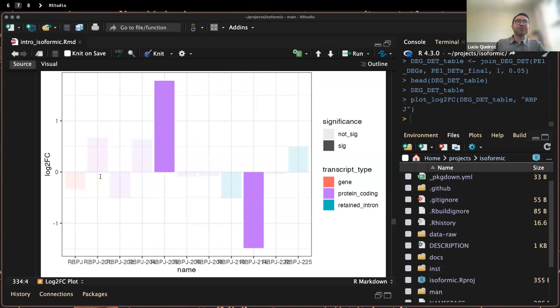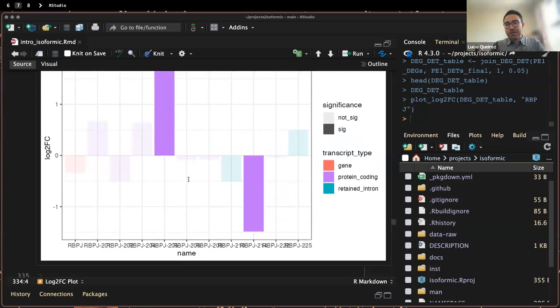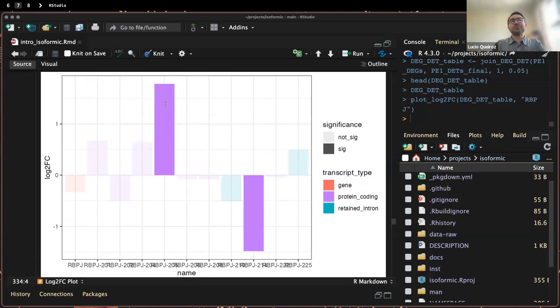Because sometimes if you just interpret the expression at the gene level, it's not that you are doing something wrong, but you are losing biology that can lead to other discoveries. Most of the time, especially if you concentrate on the protein coding genes, you can find literature about specific isoforms. If they share different exons or have a different transcription start site, sometimes they can generate totally different proteins. So even just talking about the protein level, and if you also have experiments quantifying protein, this approach can lead you to a better integration of that data.